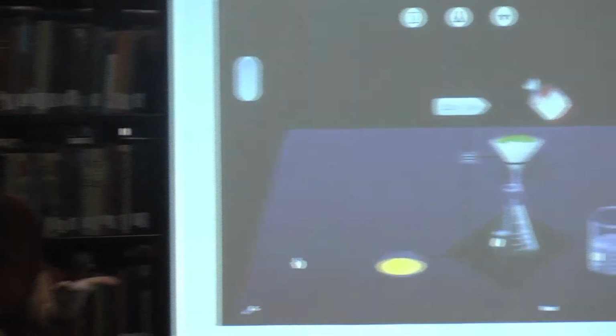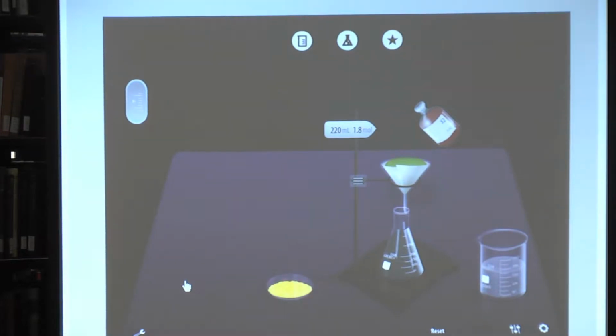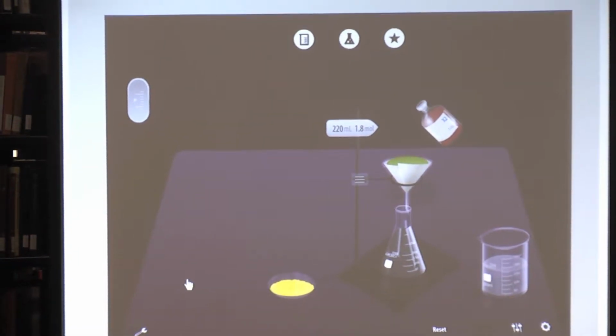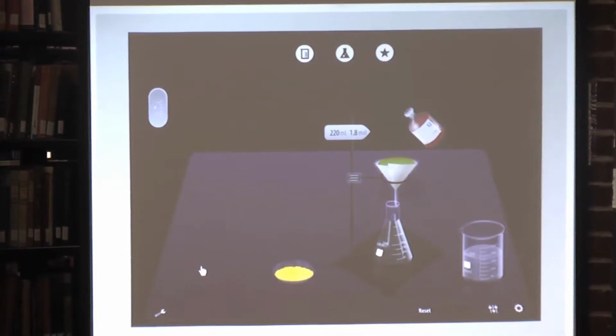Chemist was a fun app. One of the things I was trying to make sure of was that we kept it as a notebook, but also utilized the fact that it was an iPad and something fun and different. We downloaded this particular app as a simulation app, and we had the students write lab reports as if they were writing them for 6th graders who had this app. If we ever went to a school with our iPads, they could take them and run through a whole experiment using this simulation app. And it actually was a lot of fun.